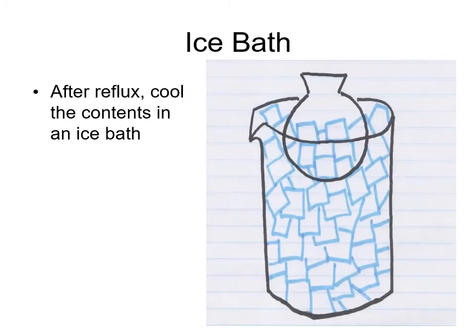Once your reaction is done refluxing, you want to cool it down in an ice bath. One thing to be very careful with, though, is you don't want to put burning hot glass in cold water because that's a recipe for disaster, right? You can crack the glass and that's very dangerous. You have sulfuric acid in here and all that. So just wait until it's cool to the touch and then put it in the ice bath.